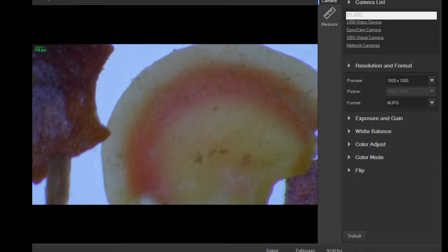You can just continue to zoom in. They had a thing at the show where you could give them a little petri dish full of stuff. I gave them trail mix and some little flowers I found outside, and said, here, shoot this for me. A couple weeks later, I got a nice photo in my email to download and scan at high res, just zoom in on the app and cruise around and see this kind of detail, but from a photograph.